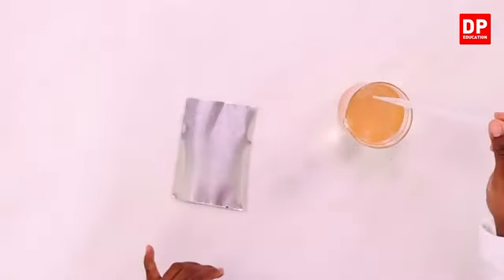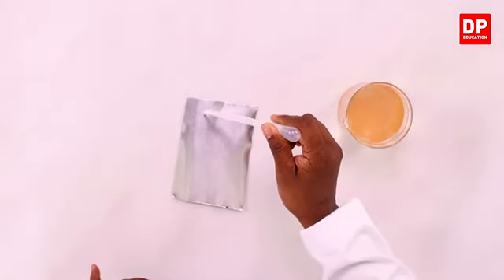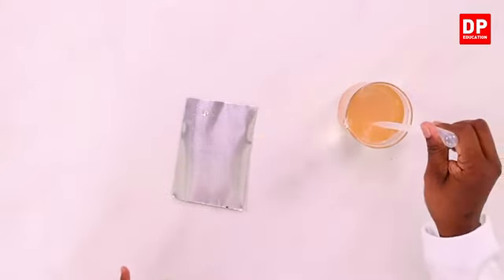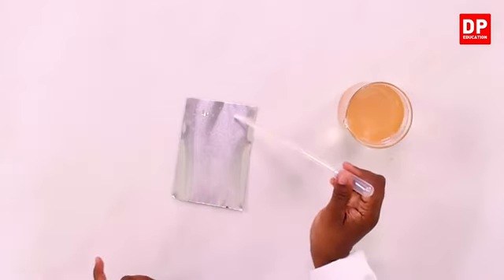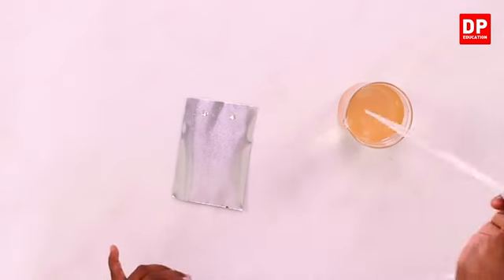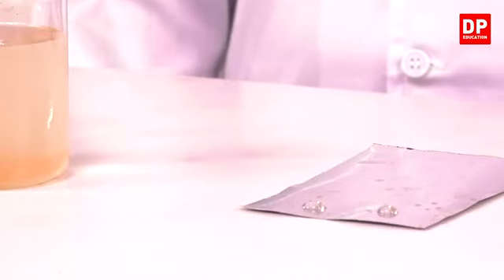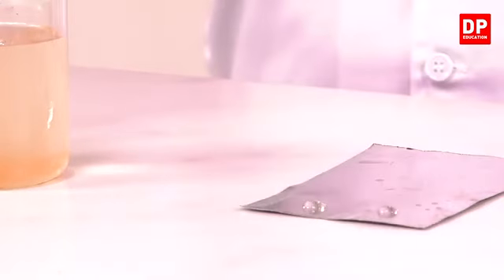Here I will take a drop from the top and place it on this metal plate, as well as I will take a drop from the bottom of the mixture and place a small amount there. So, I have the 2 samples of mixture, from the top surface on my left hand side and from the lower part of the mixture on the right hand side.